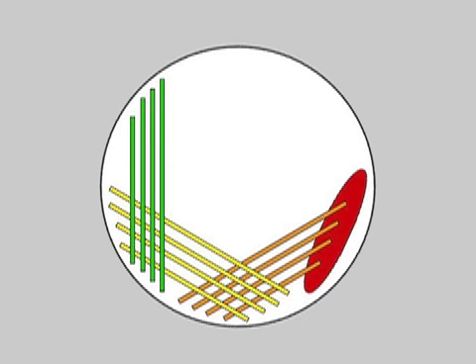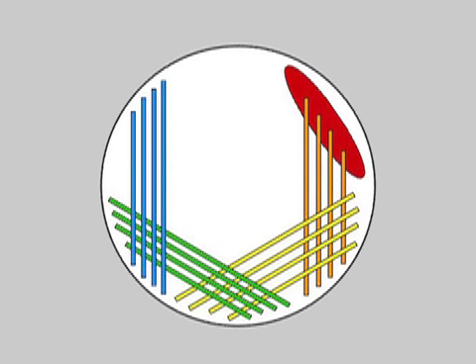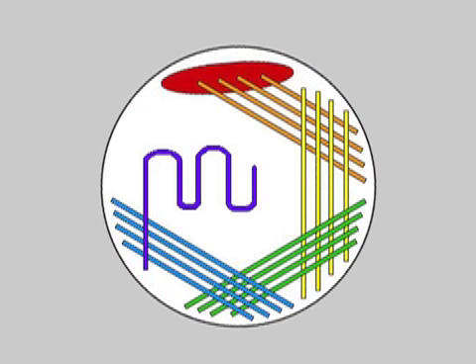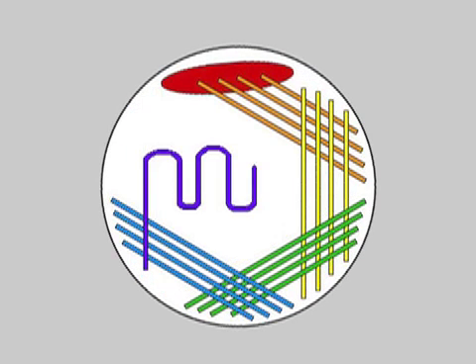This process is repeated another two times, again using a sterilised and cooled loop between each set of lines. After the fourth set of four lines, a single line is streaked crossing the final line set in a zigzag pattern into the centre of the plate.